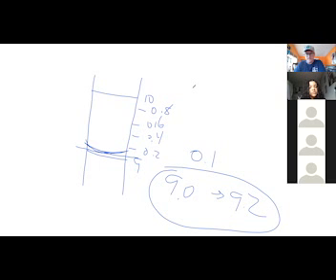So would you subtract and then divide by 2? Is that what the manual suggests you do? Yeah, the manual suggests using the gradation lines. So can we just use those, or should we be more specific? Well, have a look. For instance, the gradation lines in the 10 mL are a lot closer together than they are at the 50. There's the same number of gradations, but there's a bigger distance between them.